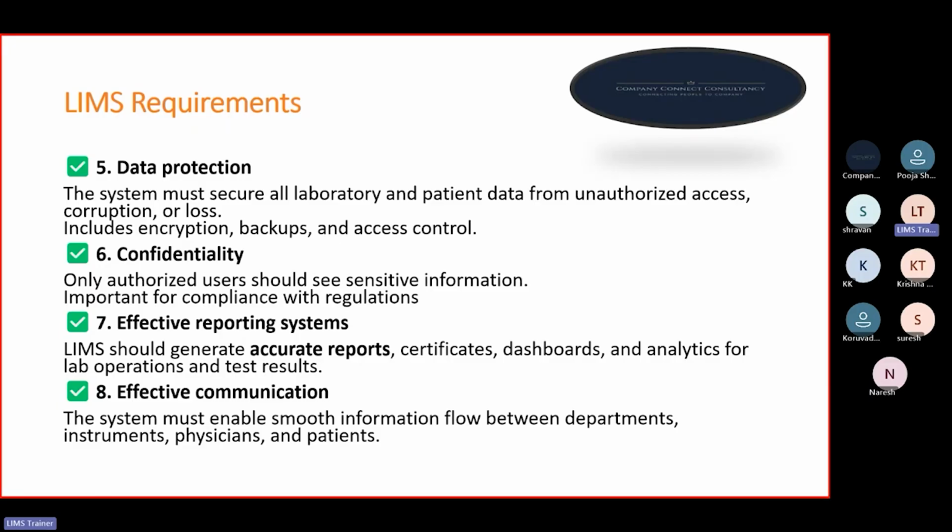So that confidentiality will be maintained in the LIMS, since the credentials will be unique, the user access will be unique. Each step will require the e-signature, so the system will capture which user did that activity, at what time, and on what date. So in the audit trail we can see who did that activity. That is how confidentiality is also maintained in the LIMS.